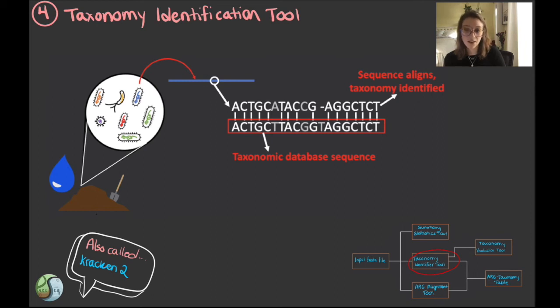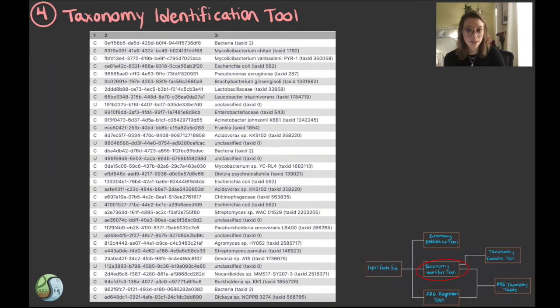Comparison is made against a standard taxonomy database operated in Galaxy with all bacterial, fungal, archaeal, and eukaryote species they have on file. It outputs all the species it can find from our water and soil samples, and this is the table that it produces. Keep in mind, although I'm referring to species, these types of analyses are rarely able to predict at that level of detail. More than just DNA sequence information is usually necessary to assign beyond the level of genus.